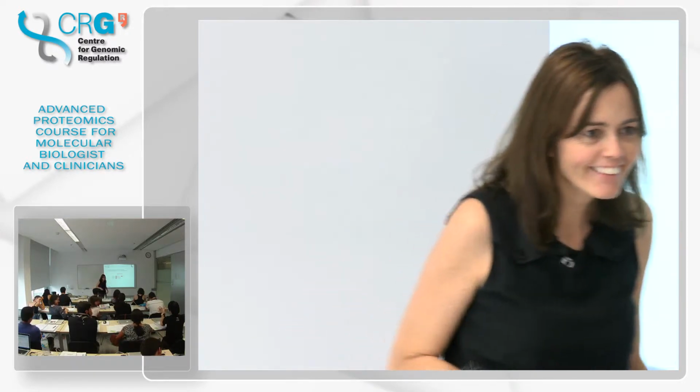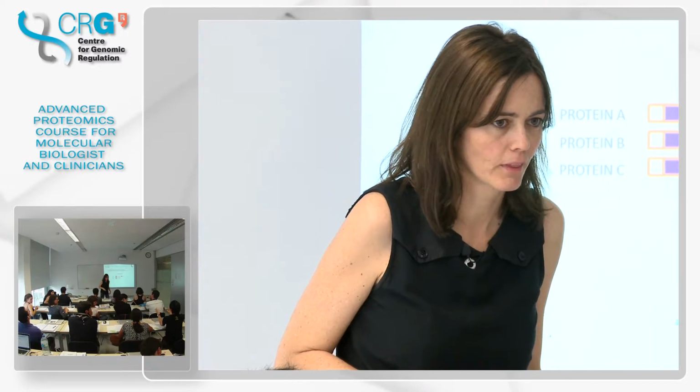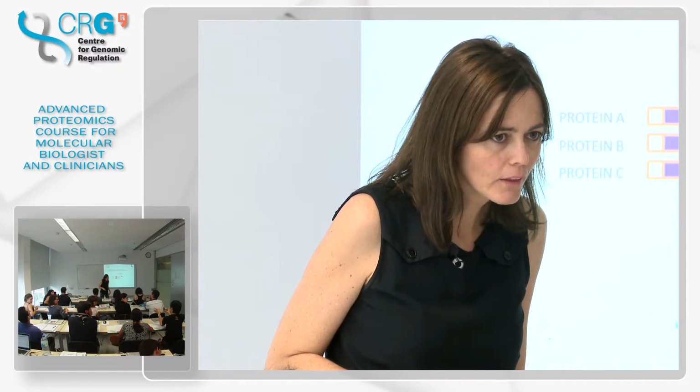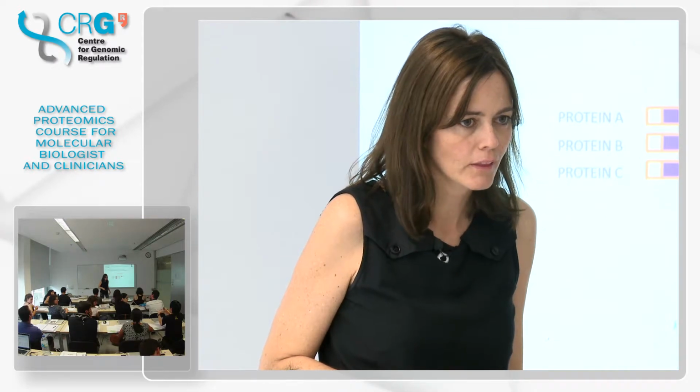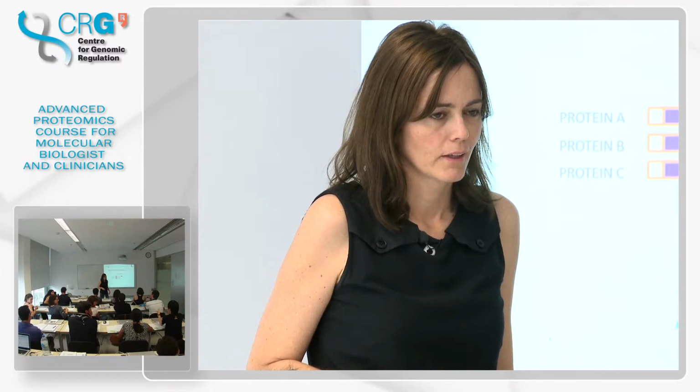Should this peptide be precise? For example, if you find a 10 amino acid sequence unique to this protein, what happens if this peptide is also processed by other proteases, or by an unknown protease in natural mode? Then it could be only 6 amino acids.